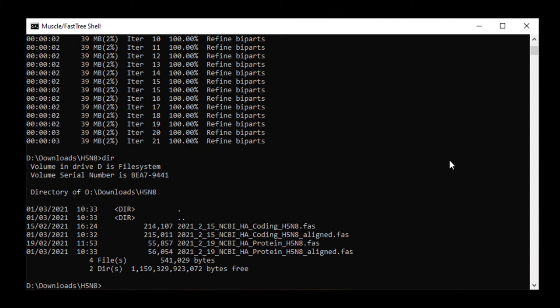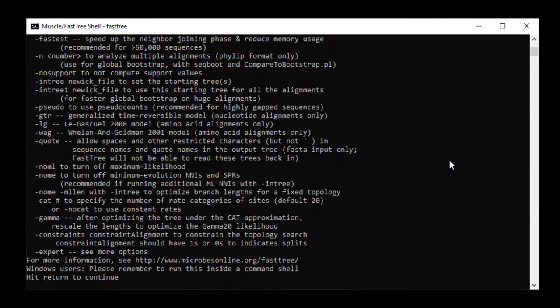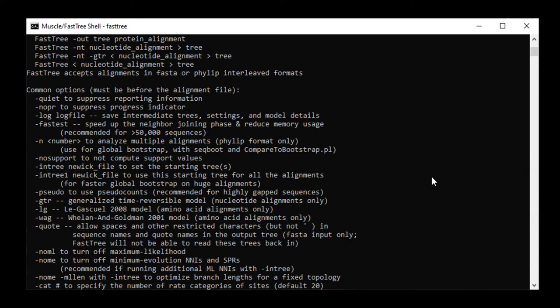If you type FastTree on its own, then it shows you the possible command lines that you can use with the program. So examples are -gamma to have the gamma correction for sites. Another example is the model types -GTR for nucleotide and -WAG and -LG for protein.